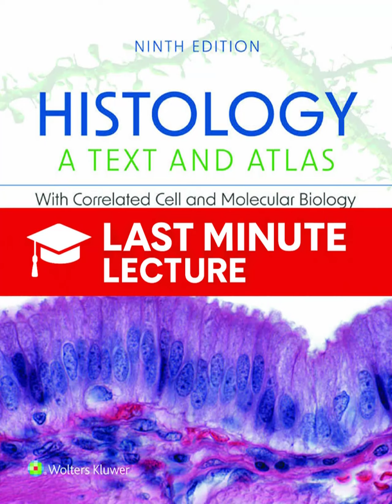And now we're seeing the rise of three-dimensional electron microscopy, or 3DEM. This is for when you need to see how entire cells and organelles are connected. Yes, 3DEM is essential for capturing biological reality. The simplest, though most laborious approach is serial section TEM, where you physically cut, collect, and image hundreds of consecutive ultra-thin sections and then digitally reconstruct them.